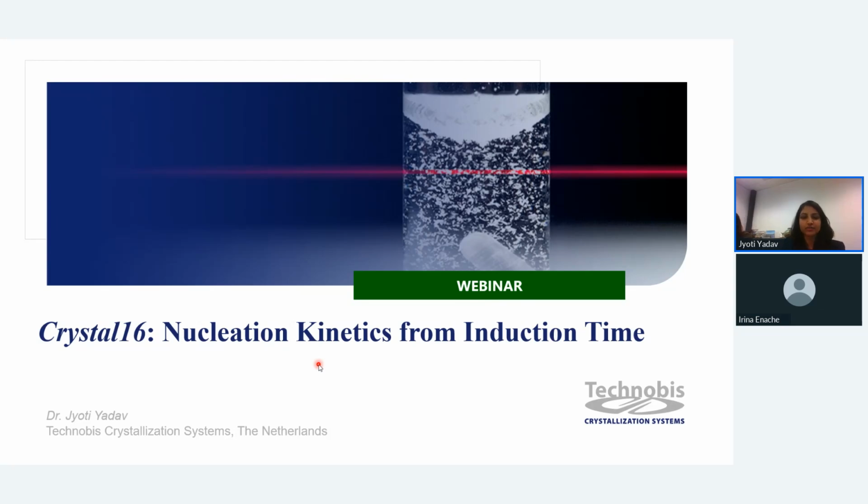Hello, everyone. I am Jyoti, application specialist from Technobis, and today in this webinar I will give the training on how to determine the nucleation kinetics from induction time measurement using the Crystal16 version 3 instrument. Although these experiments can be performed with the Crystal16 V1 and V2, for the automatic analysis of the results you will need the Crystal16 V3 version software.